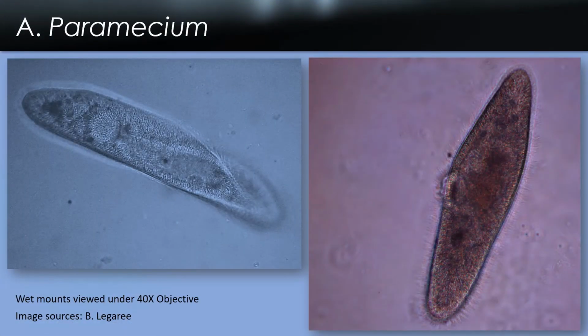The first activity will be to observe the swimming behavior of Paramecium caudatum and attempt to identify the structures responsible for its motility and other organelles such as the nucleus.